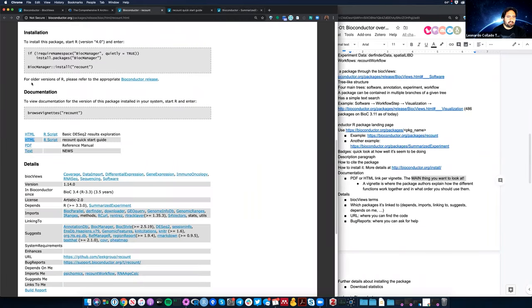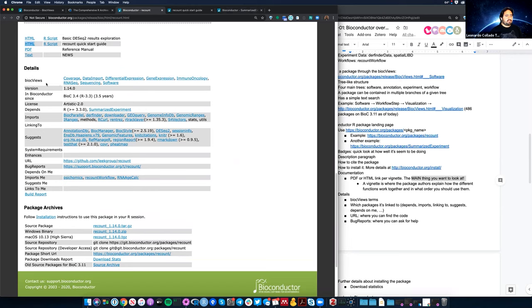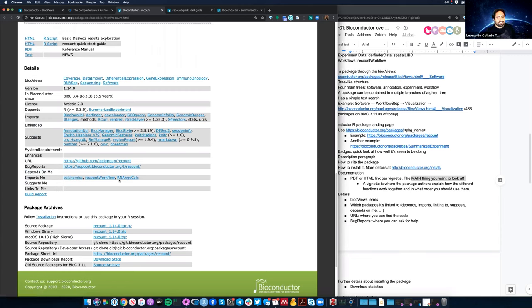Under the details section, you find quite a bit of information. It has all the different BiocViews tags showing where it belongs in the tree. It has links to all the packages this particular R package uses — imports, linking to, suggests — and also the packages that use this one, which depends on it, imports it, or suggests it. You can also find a URL for the package's source code, and the bug reports link for getting help.